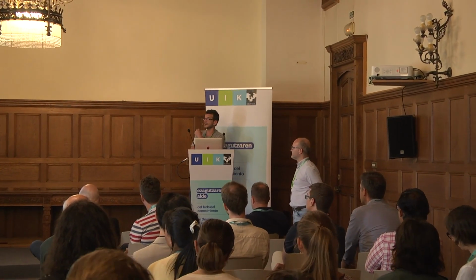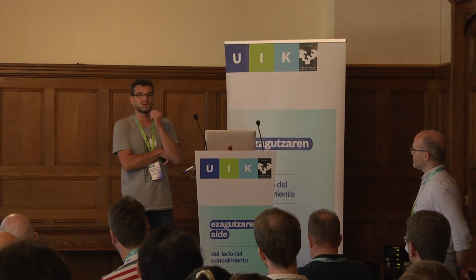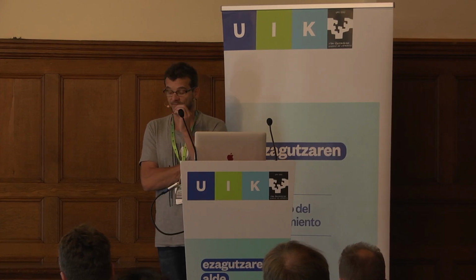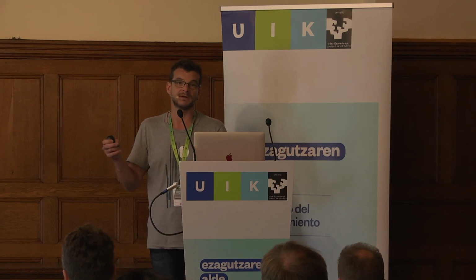What we did on the other side, I don't have slides here, is we used particularly sharp tips. We made tips with focused ion beam as sharp as 3 nanometer, and we achieved 5 nanometer resolution with these tips. We really could verify 5 nanometer resolution, but we needed to average over, I don't know, 50 line scans over the same sample area, because in a single line scan we didn't see anything apart from noise, because reducing the tip radius dramatically reduces the signal to noise. If you go from a standard 25 nanometer tip to a 3 nanometer tip, it's the same effect, just going the other direction.